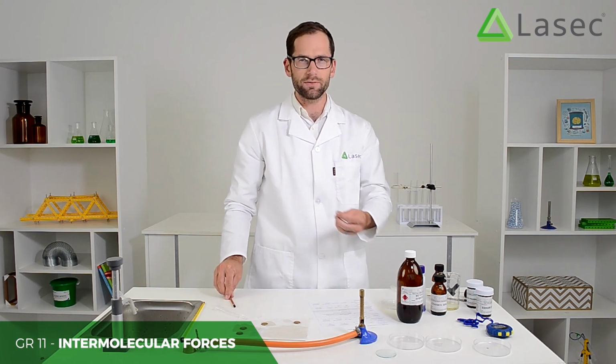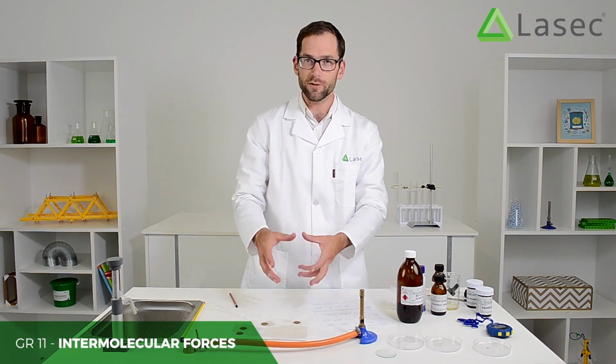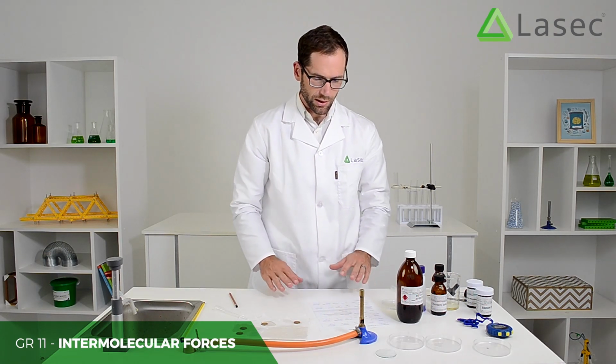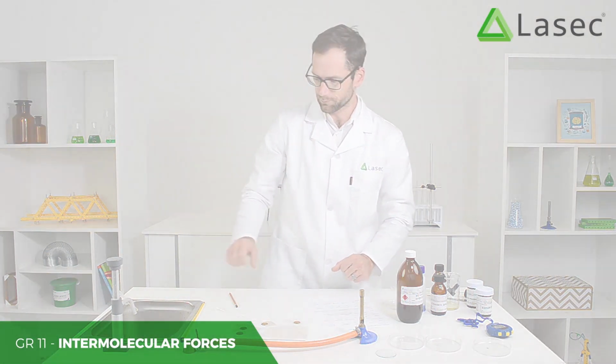Now remember, you don't want to give these figures to the learners, you want them to figure it out themselves. It's great for them to be observing, seeing what's going on, recording it, and then presenting it to you. So next we're going to look at solubility. So I'm just going to get my test tubes and we'll get set up for that.